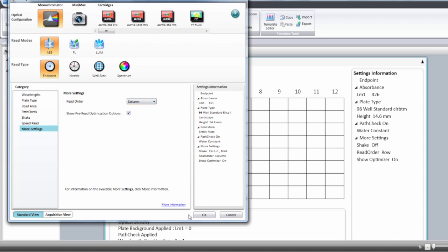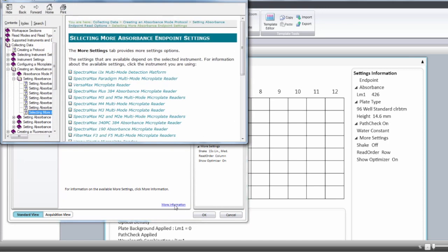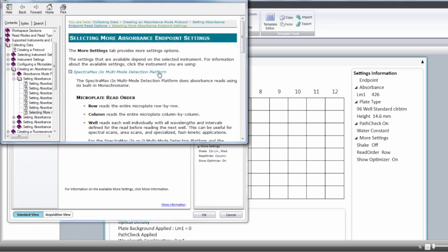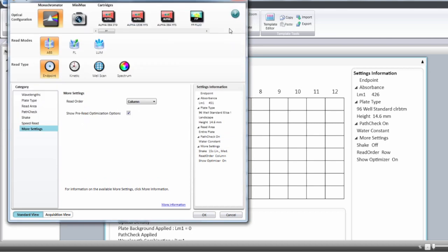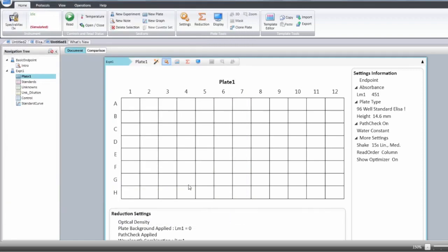In each of the settings windows you're going to have this more information link that will bring you into the manual in the section corresponding to the window you have in the instrument settings. You click OK and now you have an absorbance read for that plate.